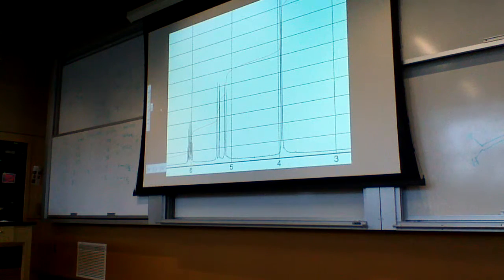So in this case, this hydrogen has 3 different sets of peaks that are splitting it, giving it a rather complex pattern, a doublet of triplets there. Because it's split into a doublet by that, and then there's 3 hydrogens there.